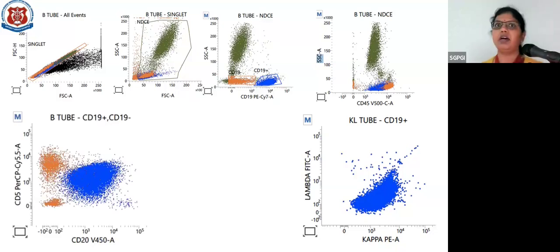Next, what we expect in CLL is expression of CD5 and a heterogeneous CD20. Our case followed that rule. It expresses CD5. We can compare with your normal T lymphocytes, which are expressing bright CD5, and this B lymphoid population is trying to encroach there. These are your normal residual B lymphocytes having a bright CD20, and the malignant cells have a lower CD20 here.